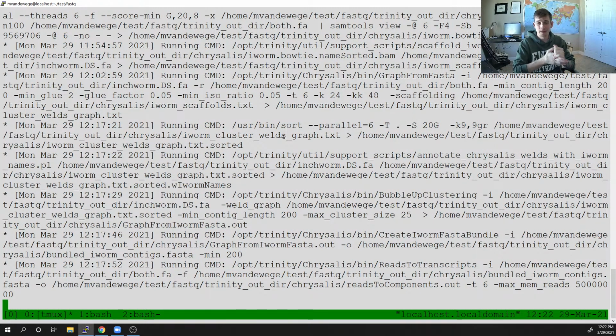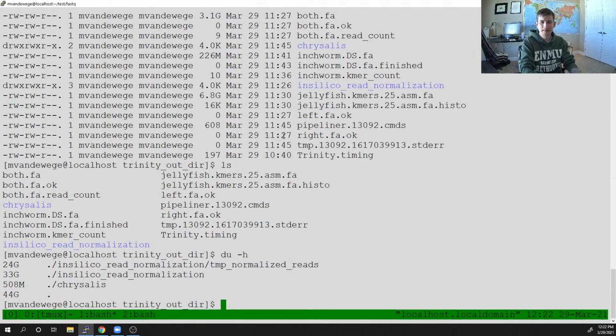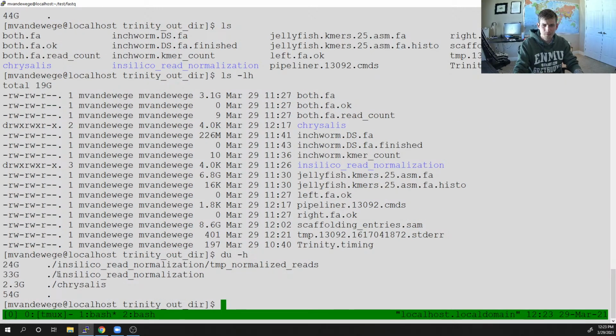As I said, this video is going to be a little bit short, just because this stuff is still running. This stuff will eat up a lot of space. My starting material was only 2 gigabytes worth of data, but by this point the in silico normalization folder is 33 gigs, and my output so far is 54 gigs.